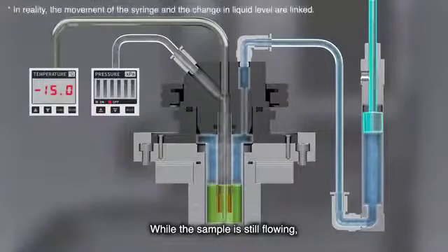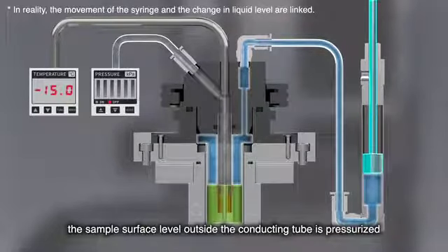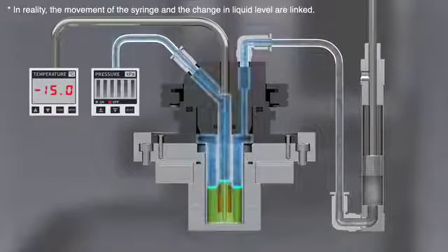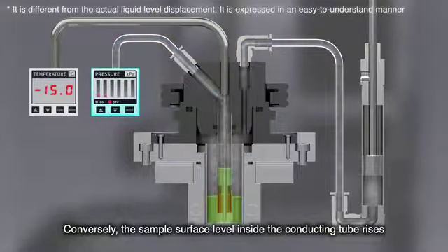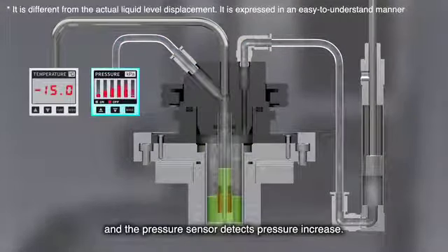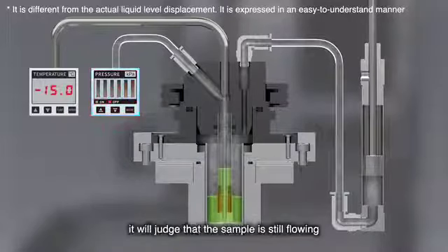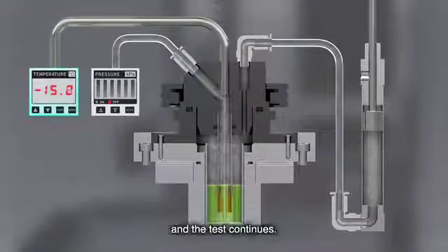While the sample is still flowing, the sample surface level outside the conducting tube is pressurized and drops slightly. Conversely, the sample surface level inside the conducting tube rises and the pressure sensor detects pressure increase. If the pressure sensor detects a certain pressure value, it will judge that the sample is still flowing and the test continues.